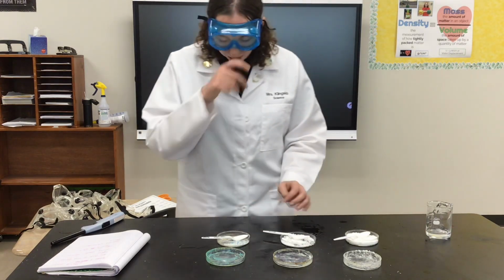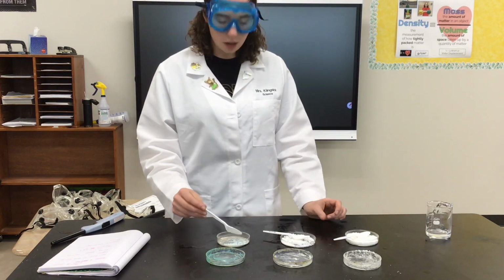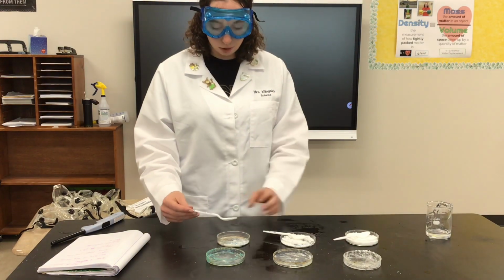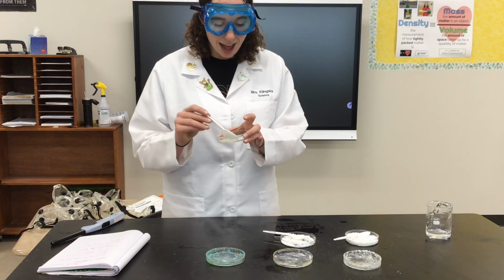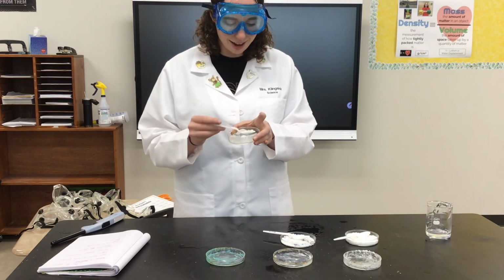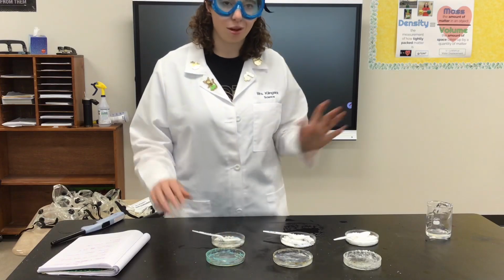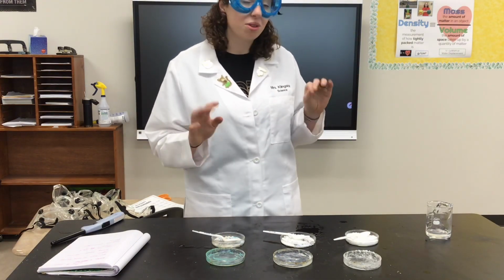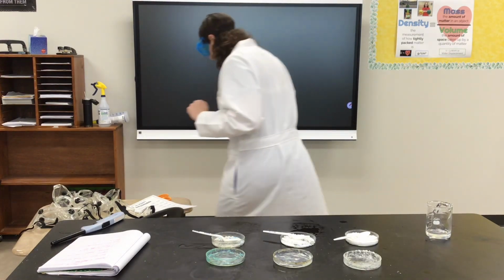And then the third thing we're going to add is actually a mixture of three things. The first one is copper sulfate. The next one is sodium chloride. And the third one is potassium chloride. So again, we're seeing that potassium. We're going to add that in and see if there's any type of chemical change. Remember, color, more being produced, those types of things. All right, I'm going to turn the lights off.